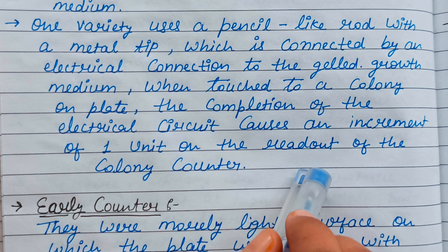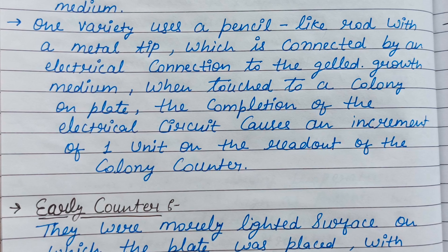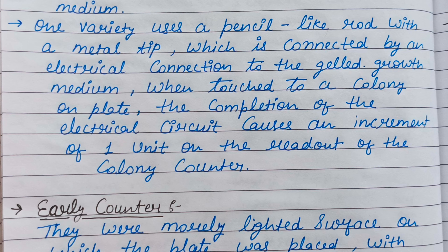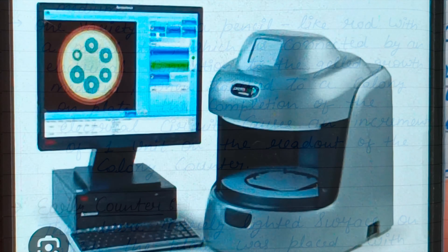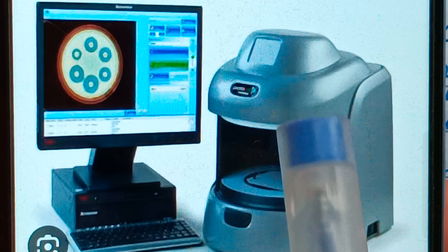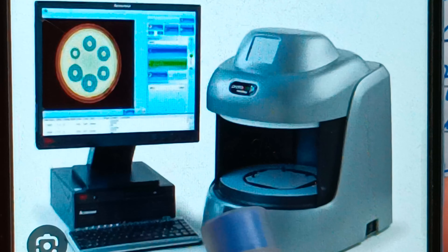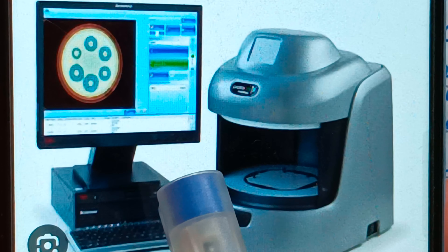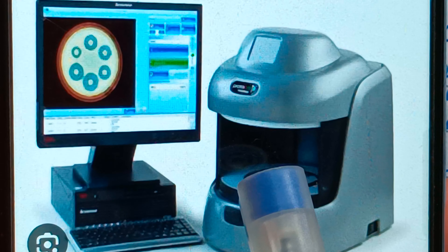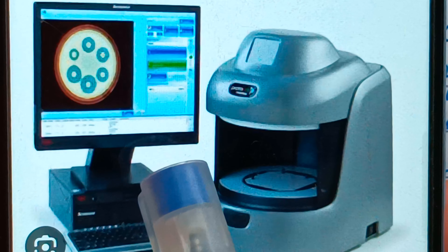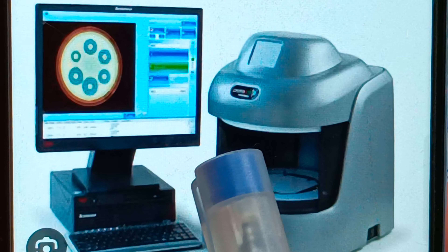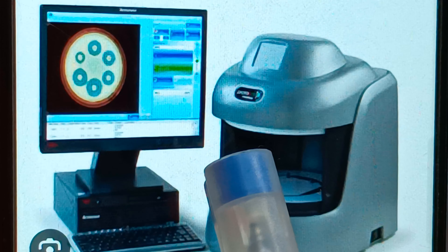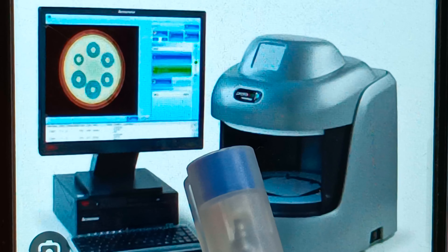Each time a colony is touched, it registers one unit on the readout. All colony samples are read out this way. You can see in the system that all colonies are indicated — such colonies, such microbes and bacteria growing — and it allows you to count all colonies and get a great result.